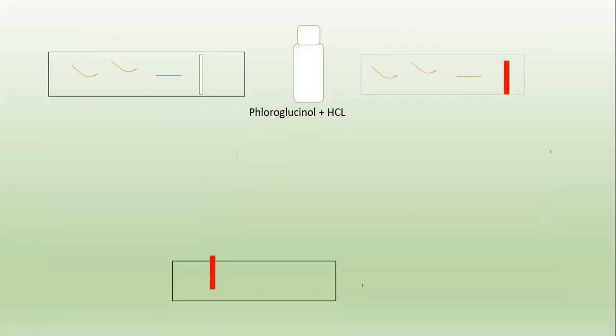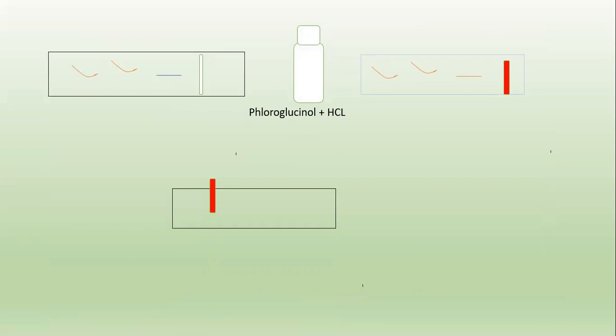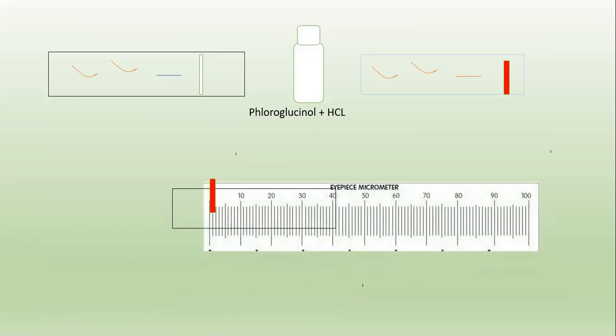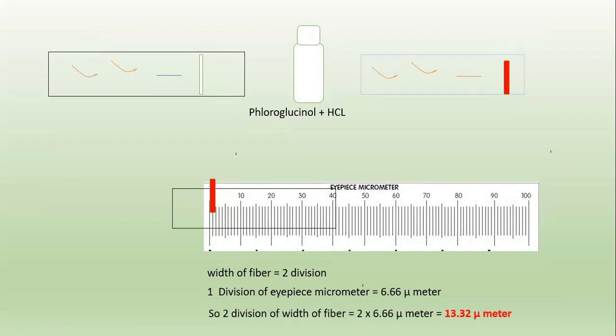Next, how to determine the width of the fiber. This fiber is stained by using phloroglucinol and HCl, which gives a pink or red color. We take this fiber and set it across the micrometer scale. The total width comes to two divisions. So the width of the fiber is two divisions. One division of the eyepiece micrometer equals 6.66 micrometers, so two divisions equals 2 multiplied by 6.66 micrometers, which is 13.32 micrometers.